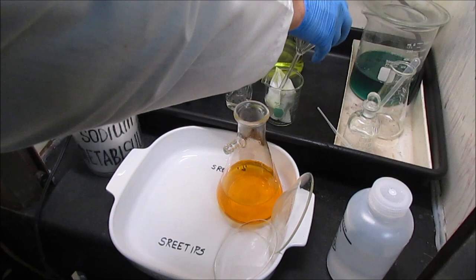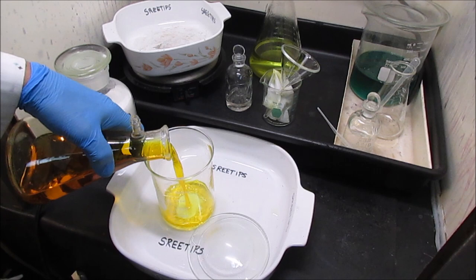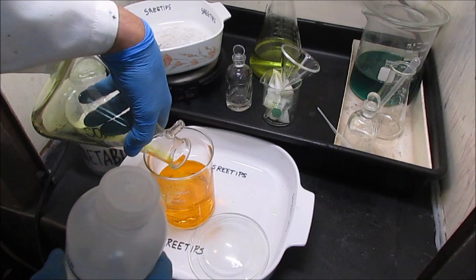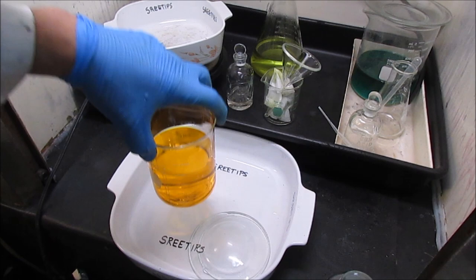Now I'm going to transfer the solution to a clean beaker. Now I'll precipitate the gold with sodium metabisulfite. It's going to be some real pure gold. You can tell by the clarity of that liquid. You can see right through it.